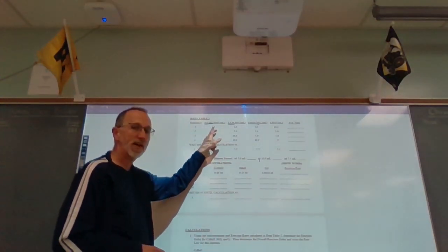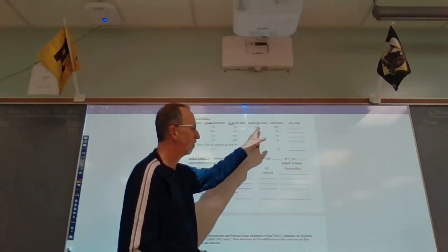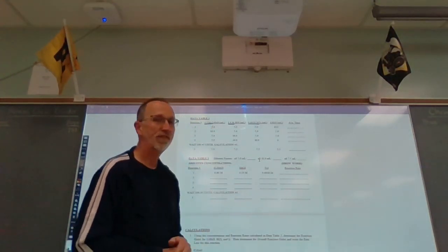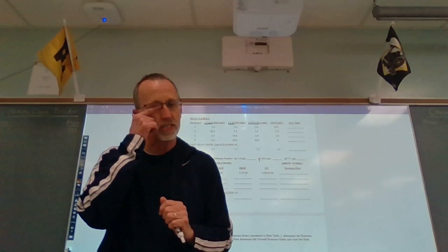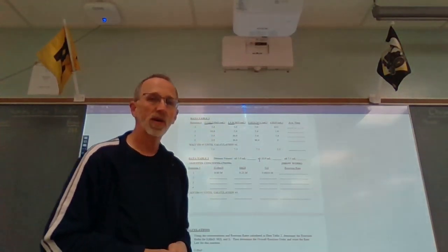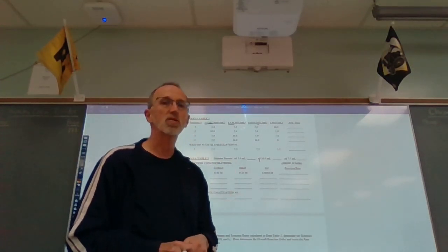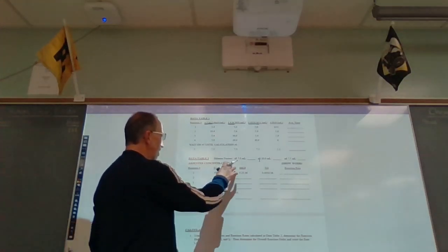Here's 5 mLs of acetone, it's all acetone, but now we've got 25 mLs volume total, but still of that 25 mLs, only 5 mLs of it is acetone. And when you take 25 divided by 5, you get 5. When we add the rest of our ingredients here, we have diluted the volume of acetone from 5 mLs to 25 mLs. So this is where the adjusted concentration comes in.